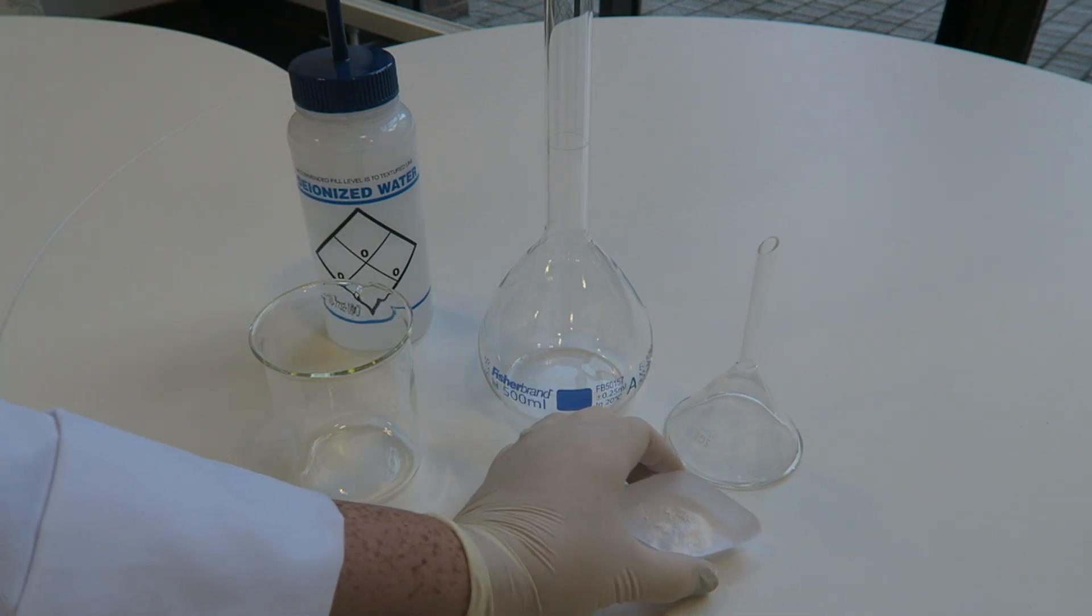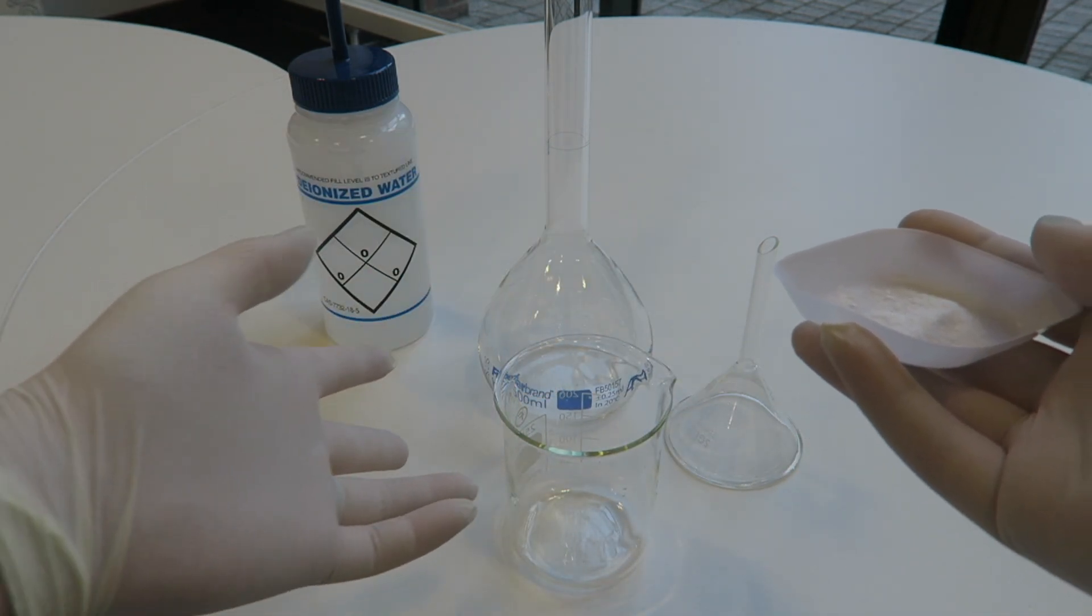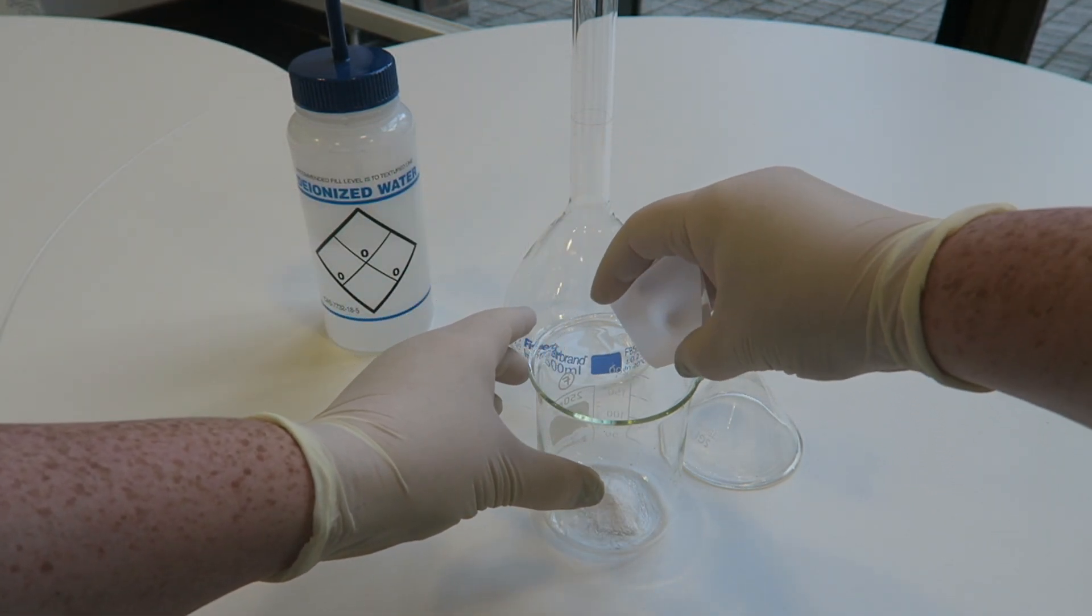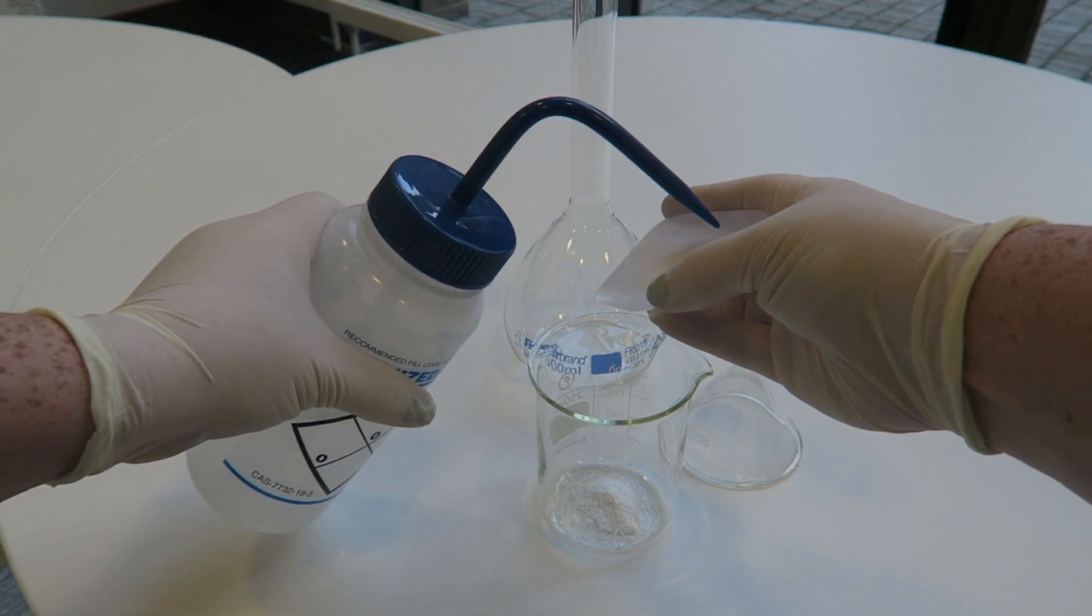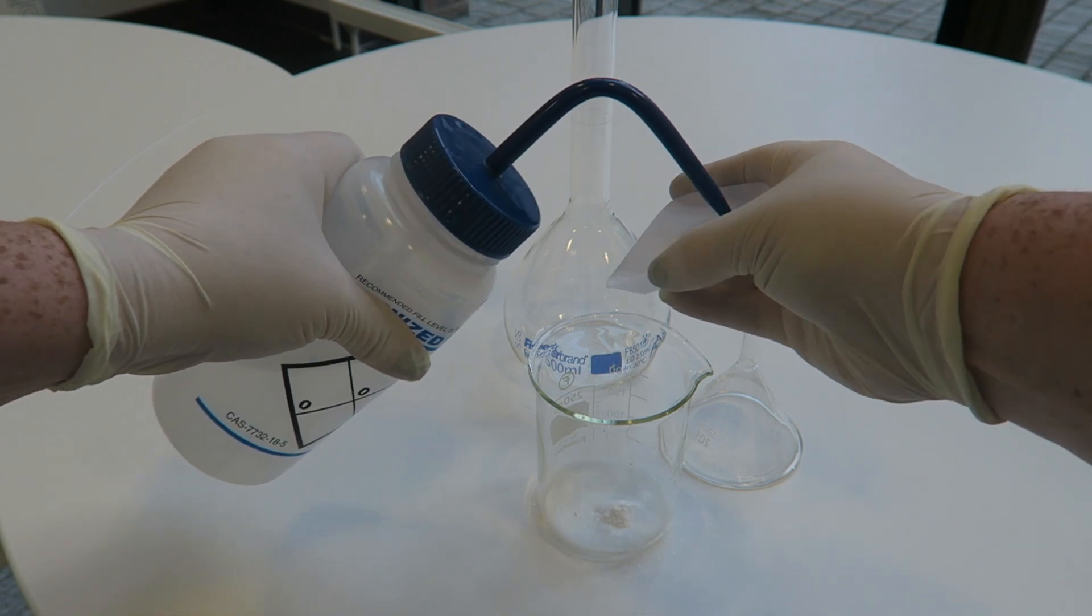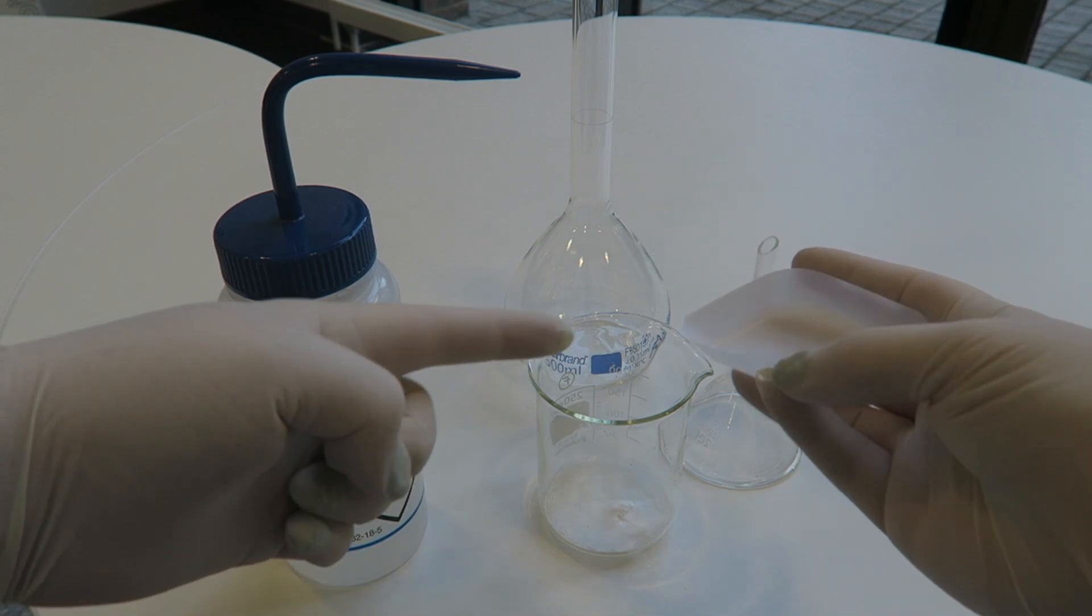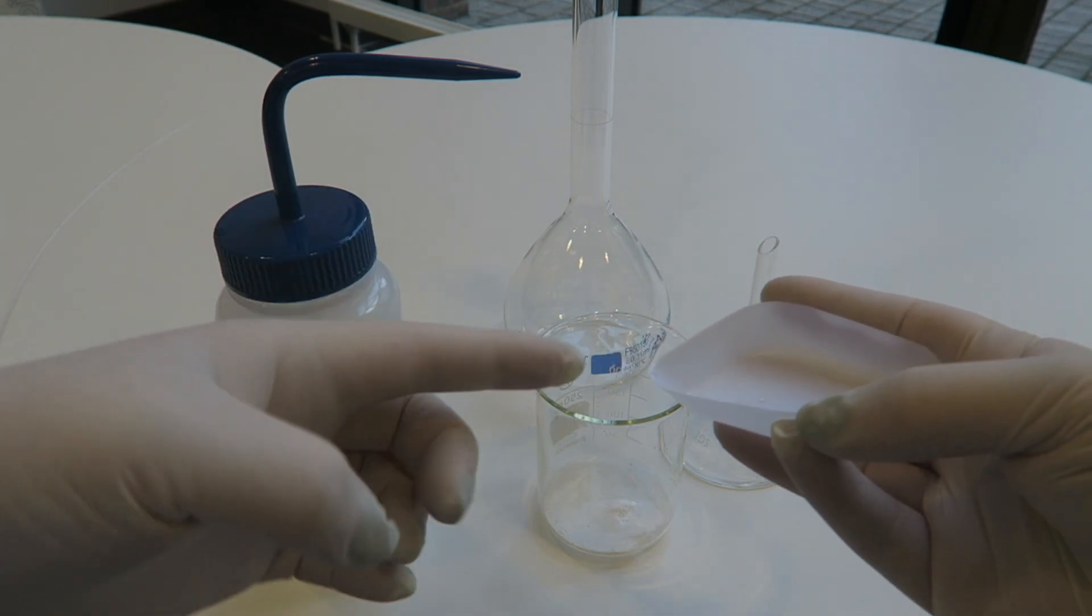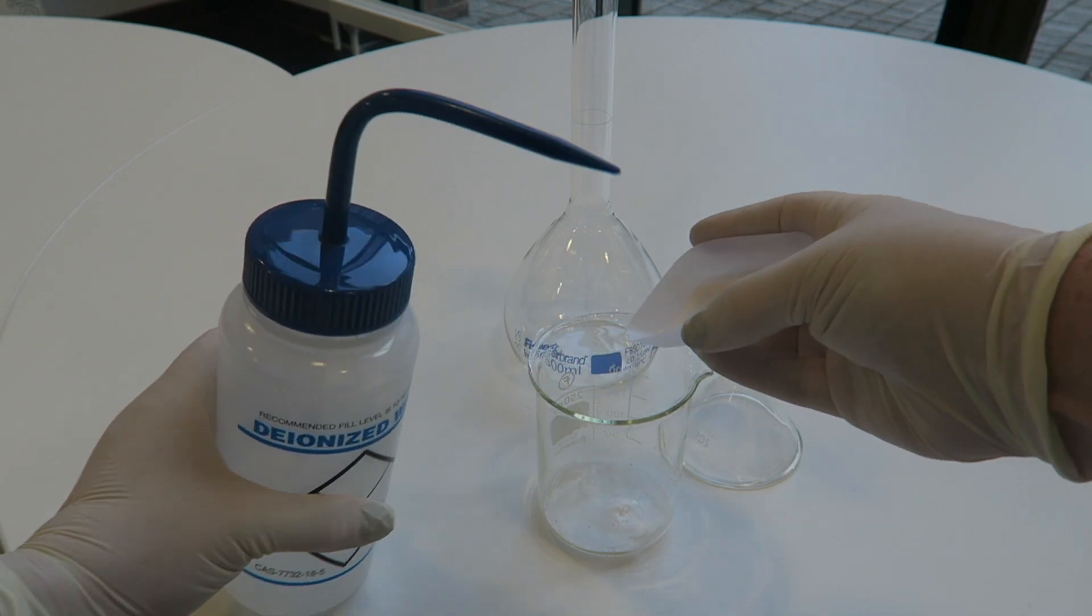We're going to take our known volume of powder and put it into our beaker with some water. Now what I'm going to do is wash the weigh boats to make sure that all of the powder from the weigh boat is in the beaker. So that is the key thing that we need to do: make sure all of the powder that we measured in the weigh boat ends up in the volumetric flask.